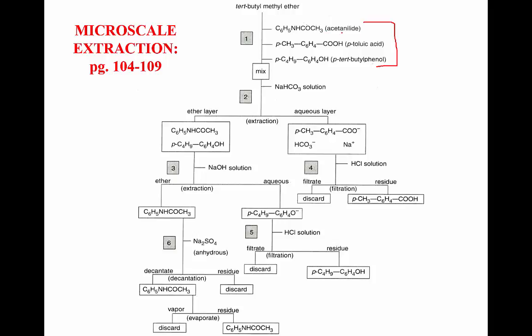And then the acetanilide that you used before with the recrystallization is essentially neutral. It doesn't really have an acid strength. Those are the three that we're trying to separate. We're going to start by dissolving them in 5 milliliters of something known as tert-butyl methyl ether. So it's just a good non-polar solvent that will dissolve these organic compounds starting out.